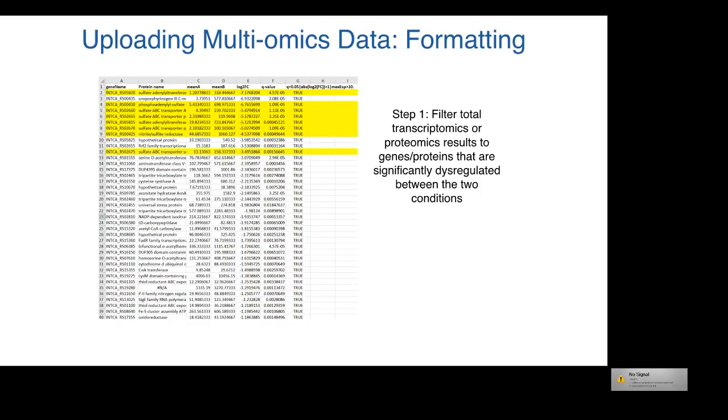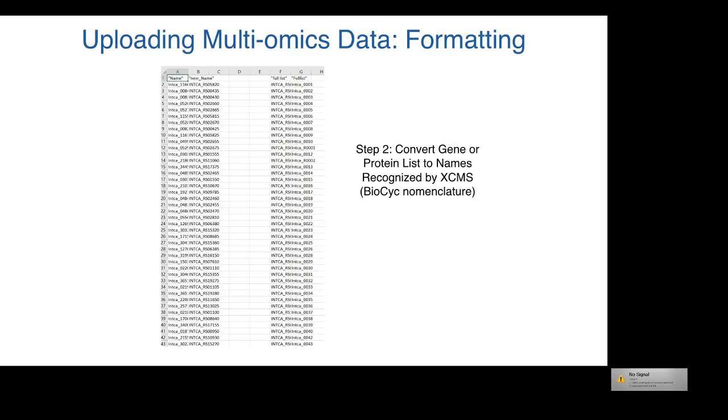And so you have to decide what that means to you. This is my actual data, or actually I should say my collaborators from this institute, from systems biology, they did the transcriptomics for me. This is their data and how we started to process to only our significant genes from our sample. But this is really a very important thing to do.